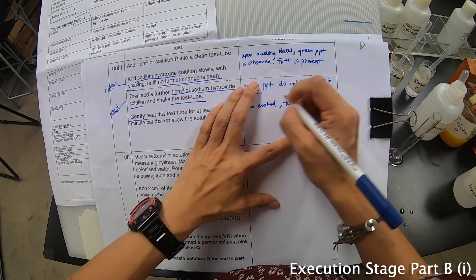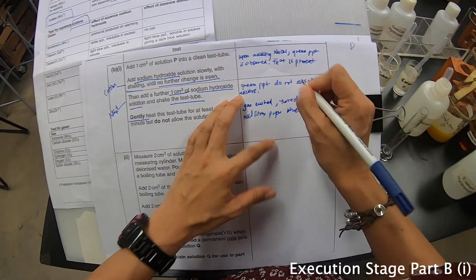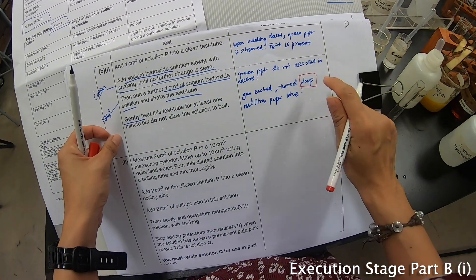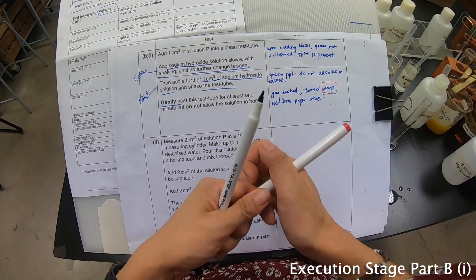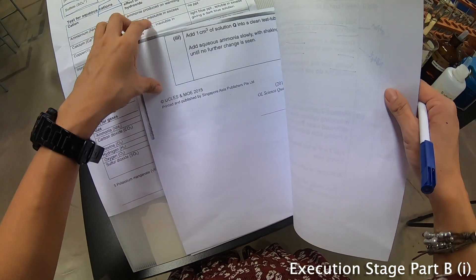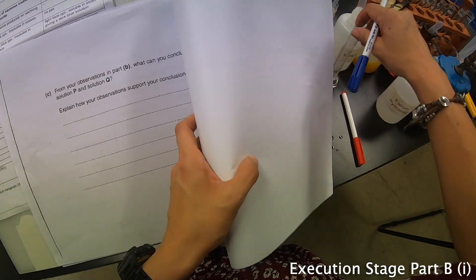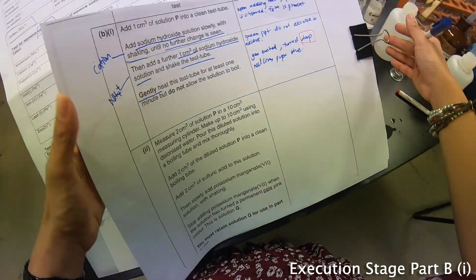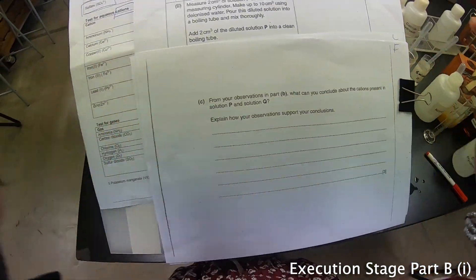The gas turns the damp red litmus paper blue. I need you to focus on the word 'damp' — the litmus paper has to be damp before you can use it to get a positive reaction. Now I'll quickly write down the conclusion, because they say you have to write about the cations present in P and Q. Let me adjust so everybody can see.